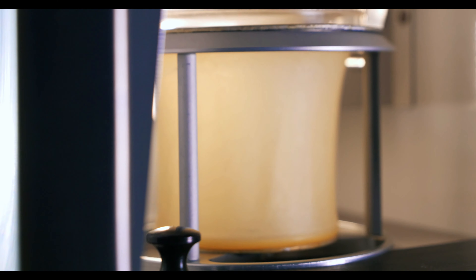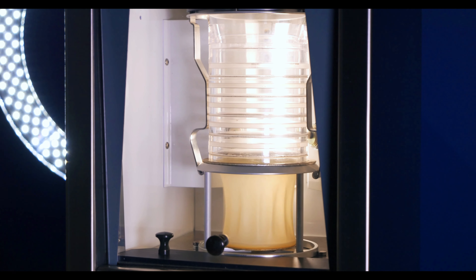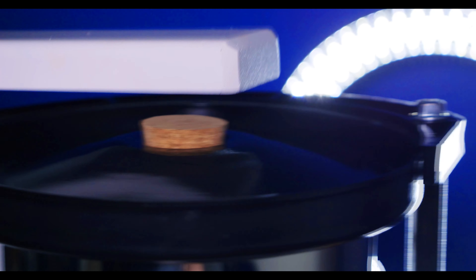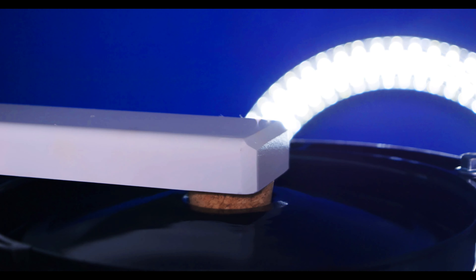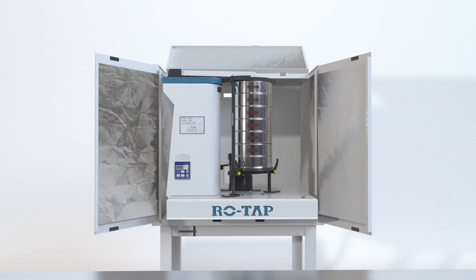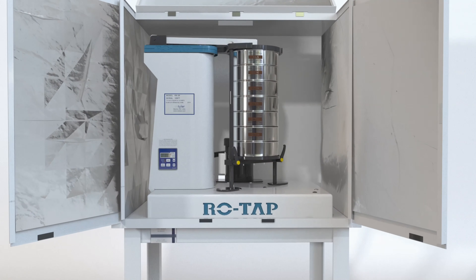Because of the sonic waves used to generate a column of air and the tapping motion to promote particle movement, some noise should be expected from a sonic sifter. However, they're still much quieter than mechanical sieve shakers. This is because a mechanical sieve shaker utilizes a hammer to assist with particle agitation and facilitate particle movement, which means these machines can be relatively noisy. The RX-29, for example, runs at around 85 decibels. The noise level is heavily determined by the material you work with, but a sound enclosure cabinet can be purchased to reduce the noise of mechanical sieve testing.